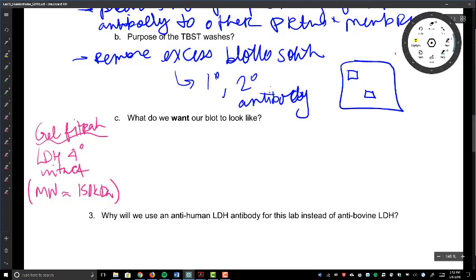However, we have to remember that for SDS-PAGE, because our immunoblot, our Western blot, is coming as an SDS-PAGE gel that has been transferred to a membrane. At SDS-PAGE, we're adding SDS, BME (beta-mercaptoethanol), and then heat.